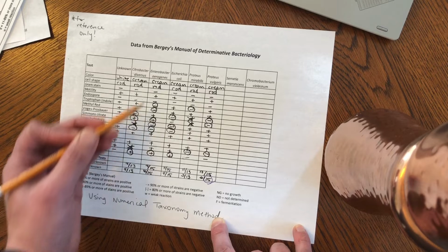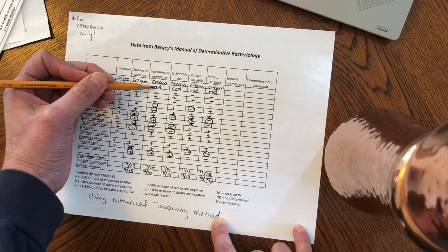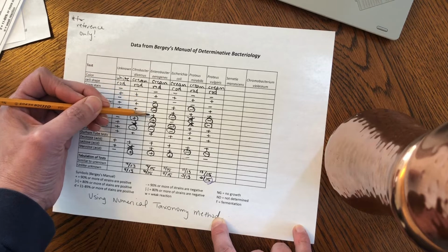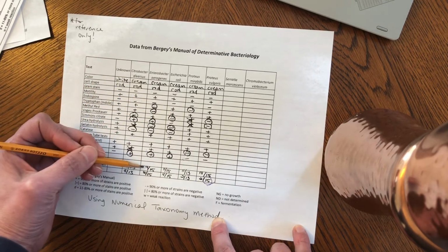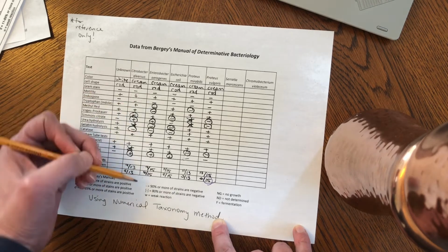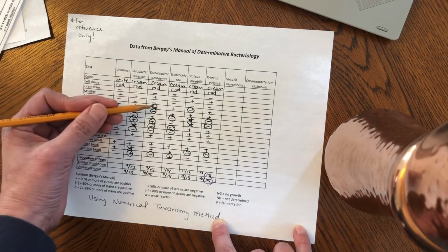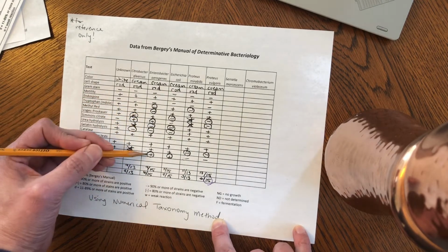And then we circled the ones that don't match our unknown. And when we count those, there's 9 of them. 1, 2, 3, 4, 5, 6, 7, 8, 9. So you see how that's how we get the 9 out of 15. And then 6 out of 15 are how many tests are unlike the unknown, which are the ones we circled. So they stand out to us. 1, 2, 3, 4, 5, 6.